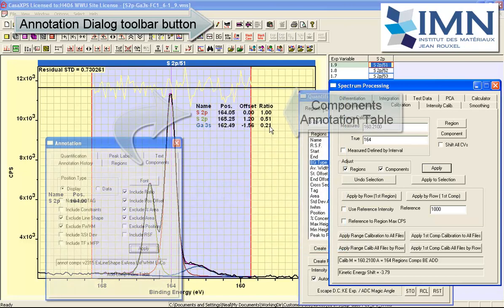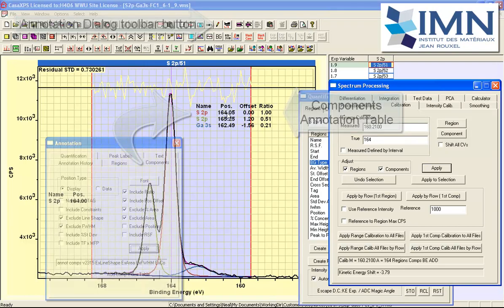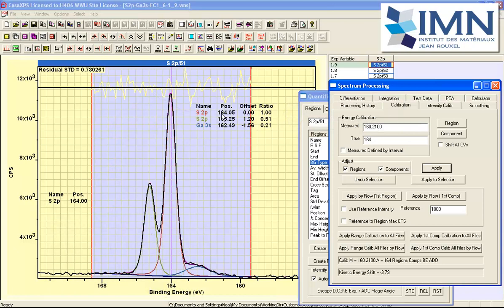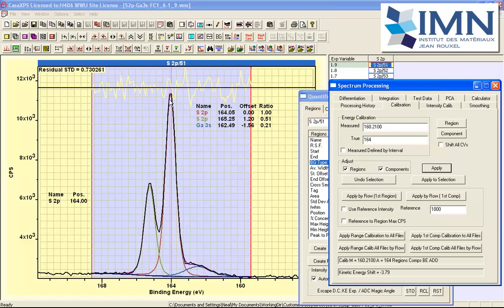This second table is gathered from the components and these components have peak positions that are slightly different on the basis that this is the peak position of a component peak fitted to these data. Whereas this one, the regions table, is gathering information from the data itself and it is calculated a position of the peak maximum.